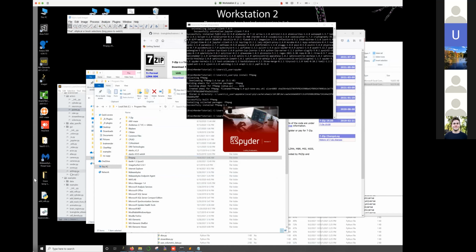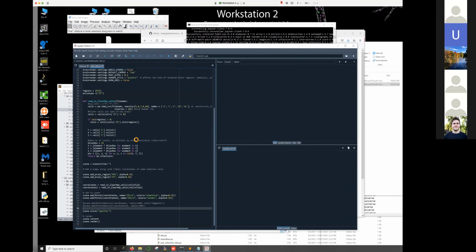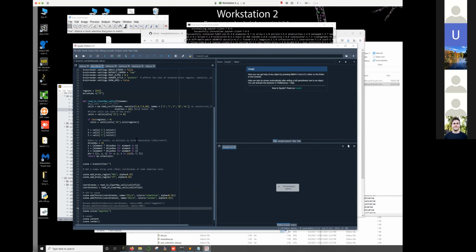really well. And I think this is actually kind of where BrainRender starts to beat something like Imaris, because just even setting up the keyframes and doing things in a repeatable way with a lot of these different cell populations and brain regions can chew up so much time. And here you can just get a script working exactly as you like it for rendering the brain regions of your interest and your cells of interest in exactly the same way for different groups or different brains.